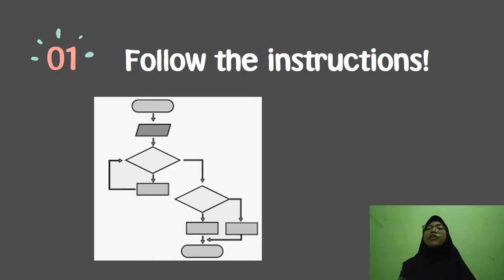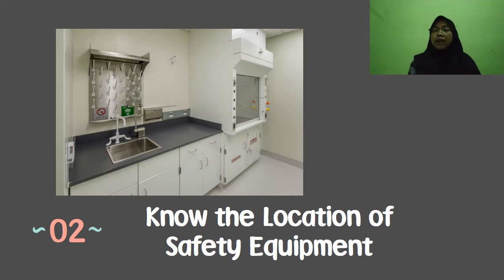It's also important to know how to use all of the lab equipment before you begin. It's important to know the location of the safety equipment and how to use it. It's also a good idea to periodically check equipment to make sure it's working.